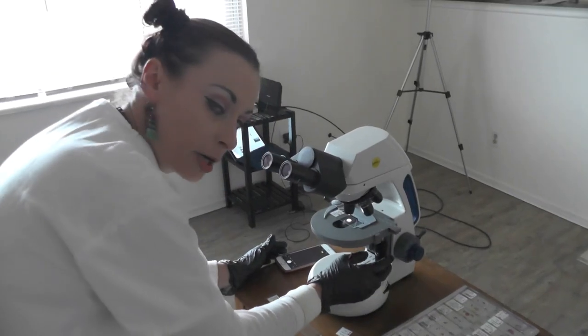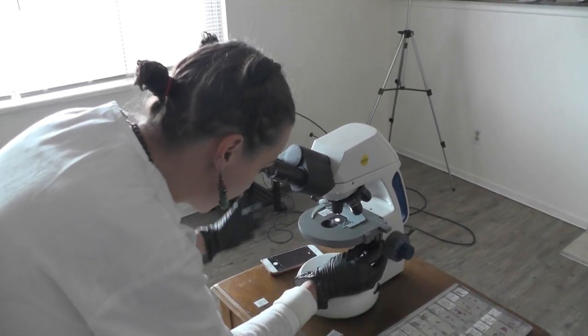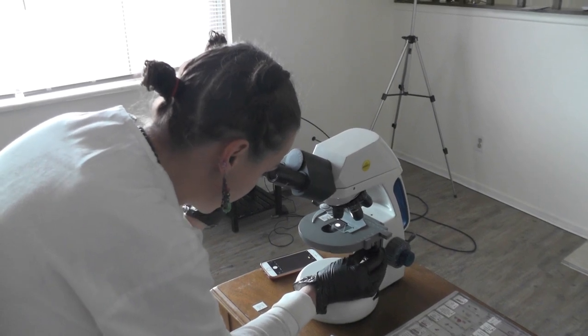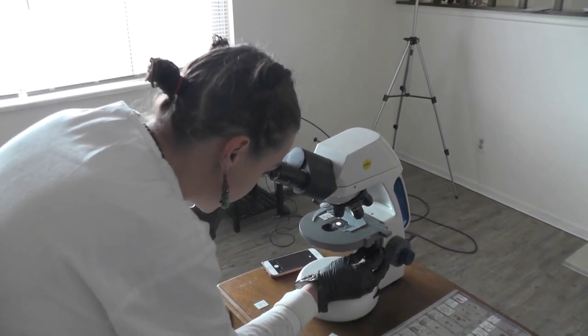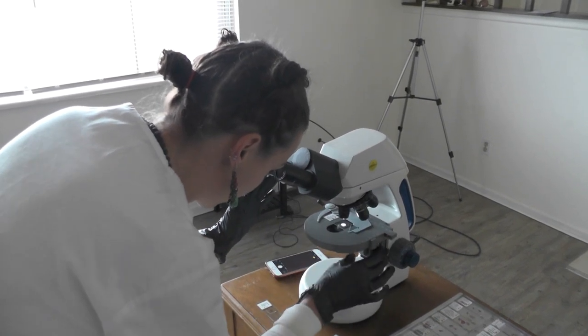So in the stomach, we're going to be looking for gastric pits and gastric glands in the epithelium that are poking down into the lamina propria and muscularis mucosae. And actually in this section that I have right here, you can see all those layers folding up nicely and the lamina propria right under it.